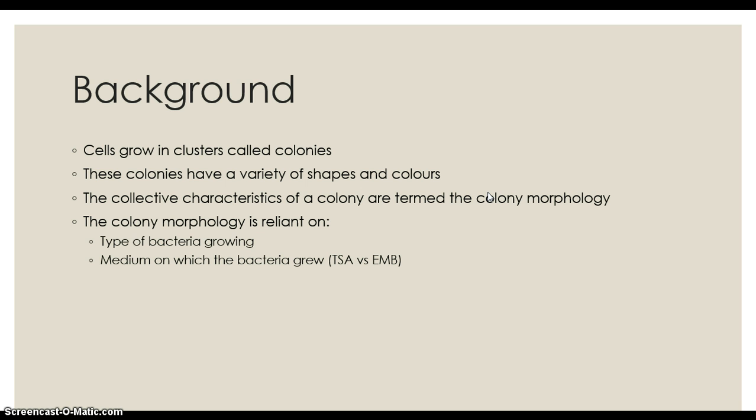But the colony morphology is reliant upon the bacteria growing, of course, and actually the medium on which the bacteria grew. If you remember, when you grow E. coli on a TSA plate, they're like these circular, white, little colonies.